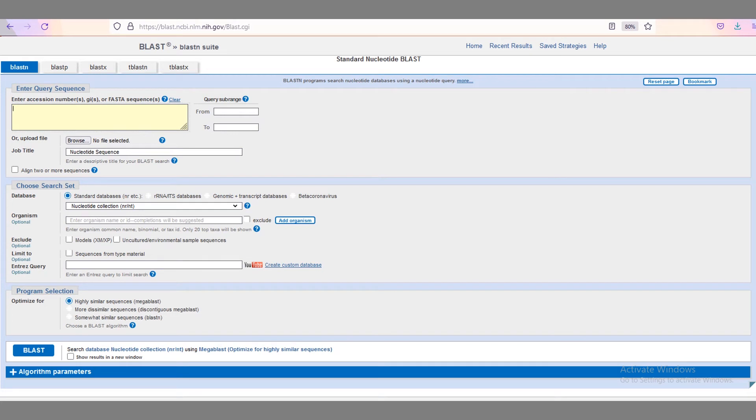When I get the results back, I copy the gene sequence one by one into the BLAST website run by NCBI. I put it in the box at the top left — we do have more detailed instructions on how to do this on the Bento Lab website, so if you're interested please do check that out. Then I click BLAST and it comes back with the closest hits to the sequence against the database.